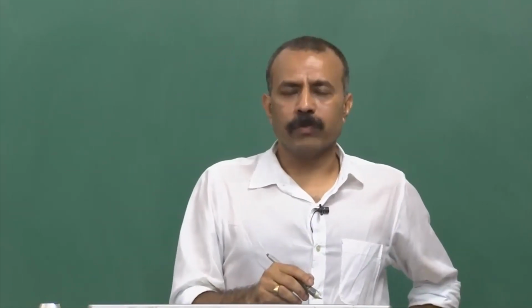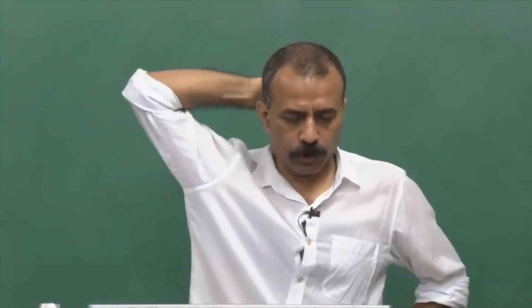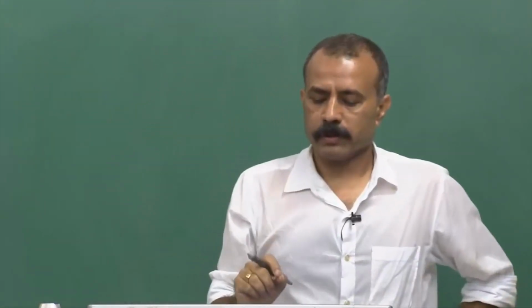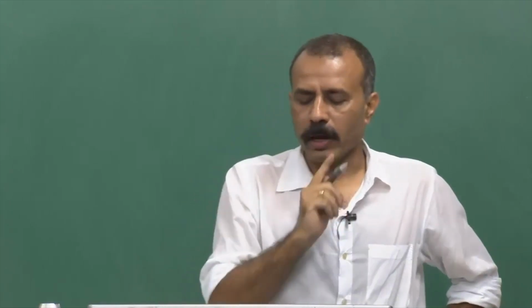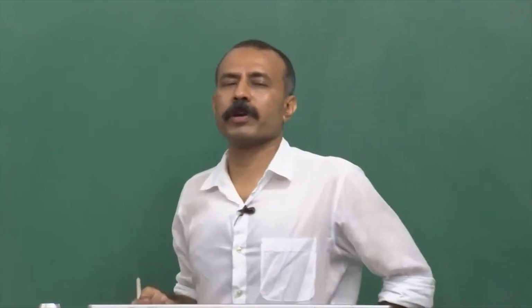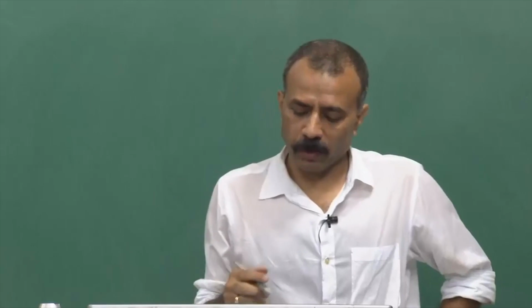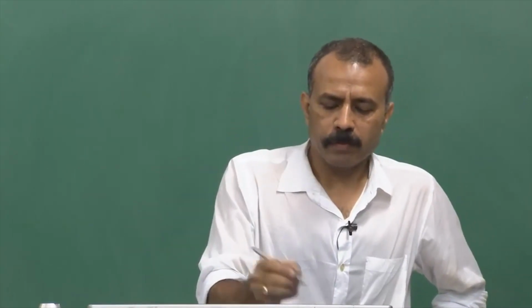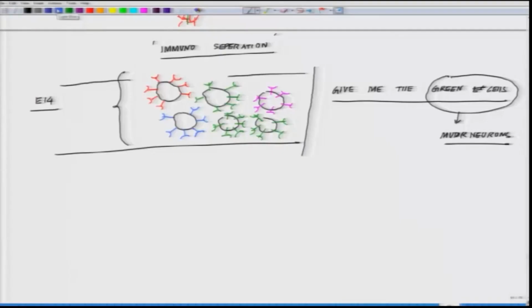So, at around E14, there are motor neurons. Most of the motor neurons express very unique receptors. I am just telling the story of how people went into immunoseparation of neurons, motor neurons, as a case study. Now, what they did was very interesting. Parallelly, there was some individual who had developed earlier than that an antibody against this part, the one I am circling.